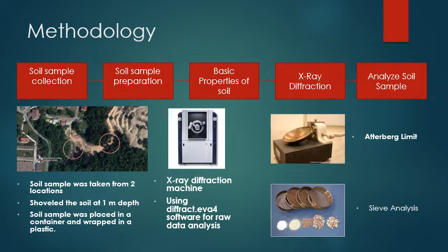I used the X-ray diffraction machine at Universiti Kebangsaan Malaysia because the availability there is cheaper than at other institutes. I will be using Diffrac.EVA software for raw data analysis. For basic properties of soil, I conducted the Atterberg limit and sieve analysis.